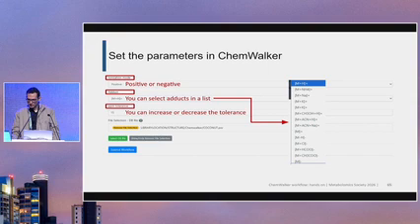But for untargeted studies, if you're not tracking something in particular, set it as low as possible, and my suggestion is to be strict on the other information, such as the number of shared peaks or the cosine score.